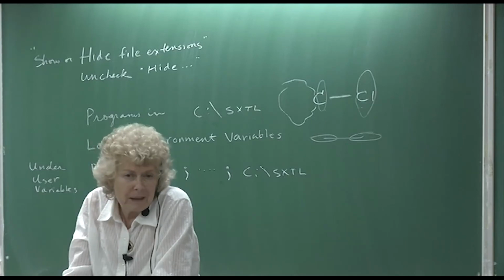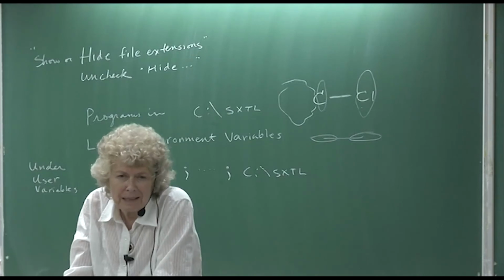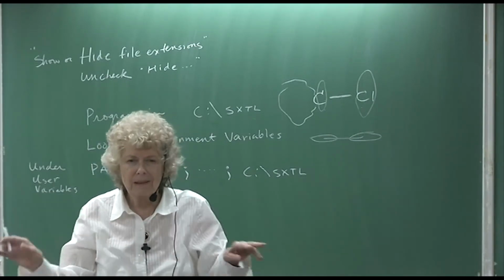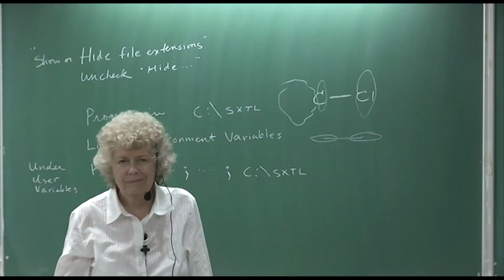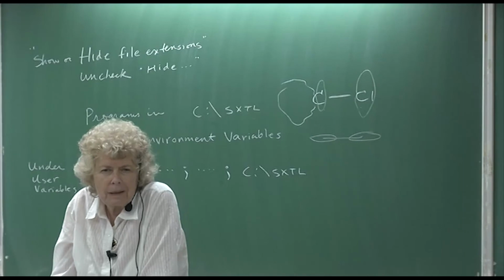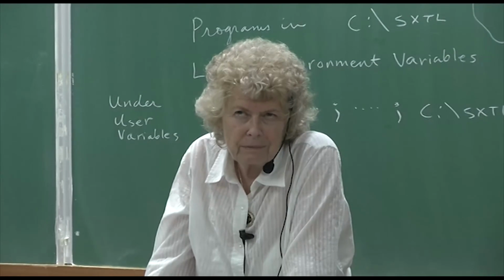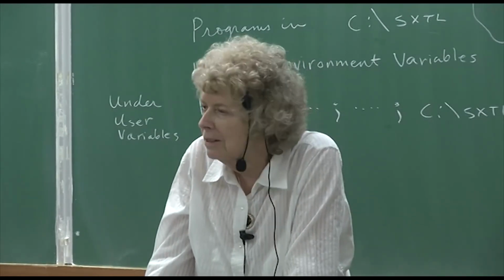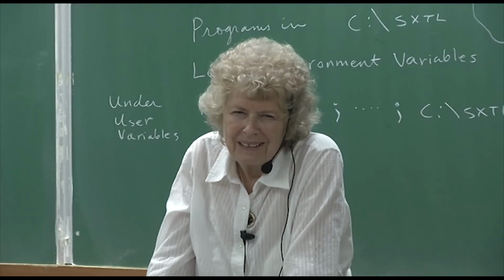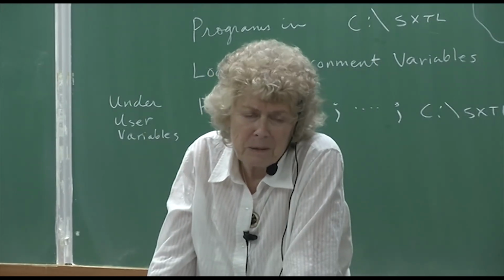And especially if you have a double bond, a double bond is going to make the Hirschfeld thing look funny, right? Because you're going to have a lot of electron density between the two atoms. So sure, the thermal ellipsoid is going to be looking that way because of the double bond. To avoid it? It's not a fatal issue. I think it's just sort of a warning. So when you run the checkCIF, there's alert A, B, C, D, E, F, G. At least goes to G, yeah. It's usually not an alert A or B. It's usually down further. If it's extreme, well, maybe you have the wrong atom type. That's possible.